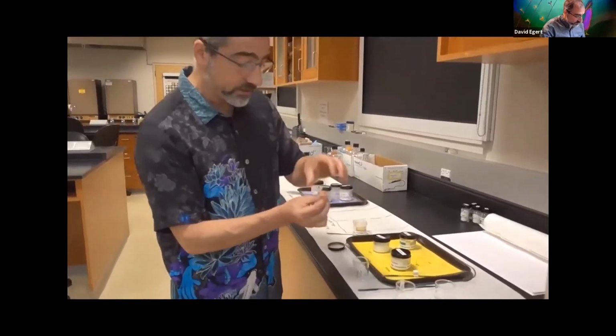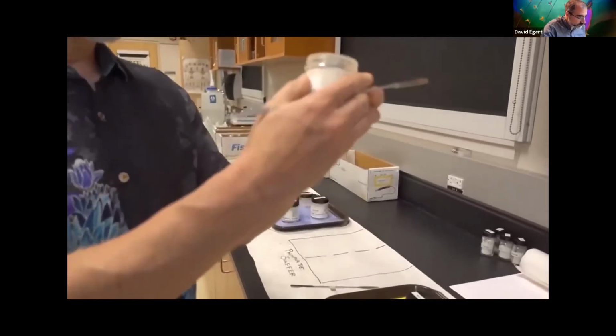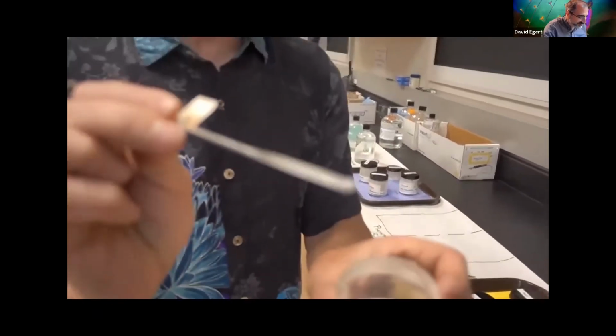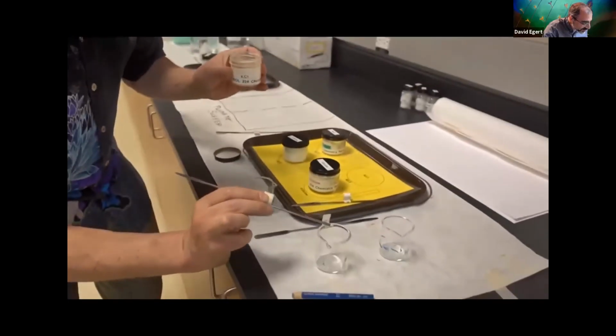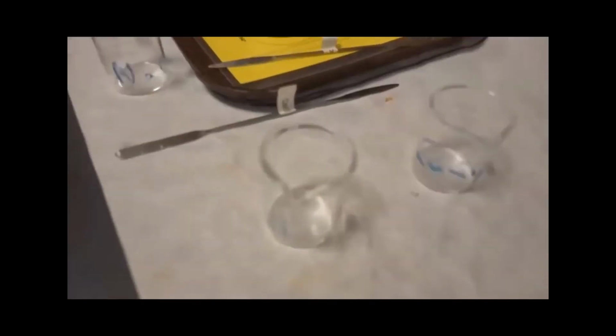But here, potassium chloride and a pinch, again, enough that you can see it, like the end of your fingernail, but not too much, because if you try to dissolve a whole cup of sugar in a teacup, it's ridiculous.